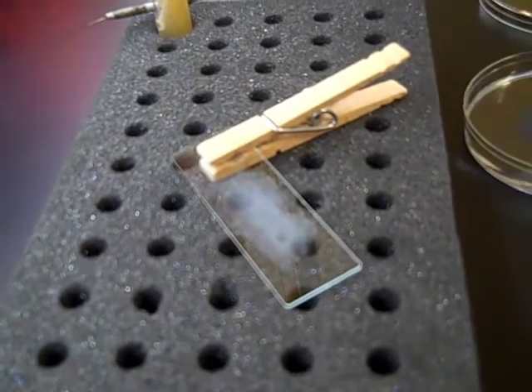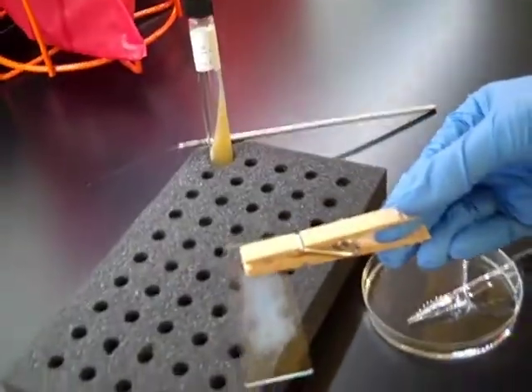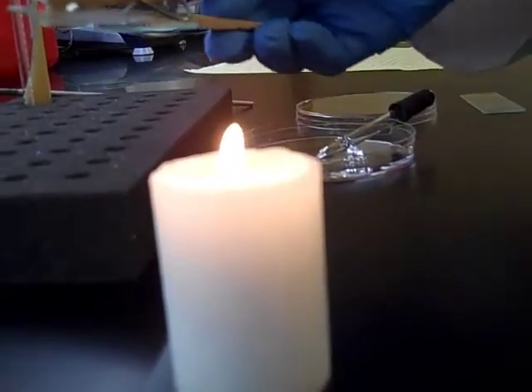Once it's air dry, you're going to use a clothespin to pass the slide through the flame two or three times. This is going to heat fix the bacteria to the slide. Simply pass it two or three times and that's sufficient.